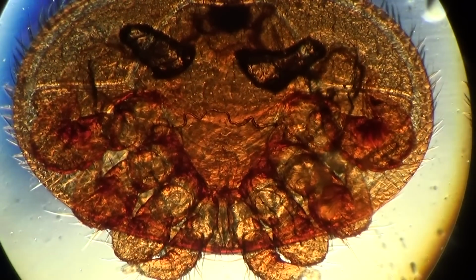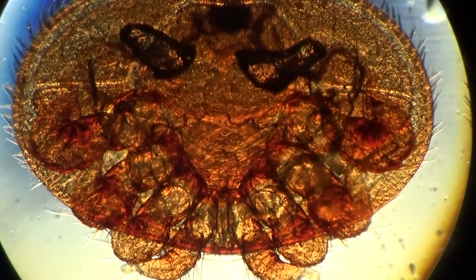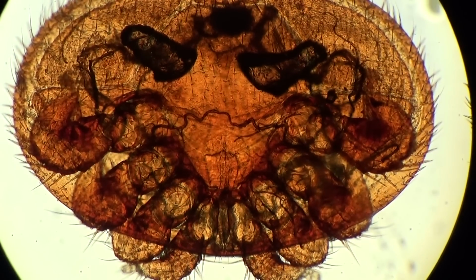Up to 18 females have been found on the body of a honeybee. So many mites.